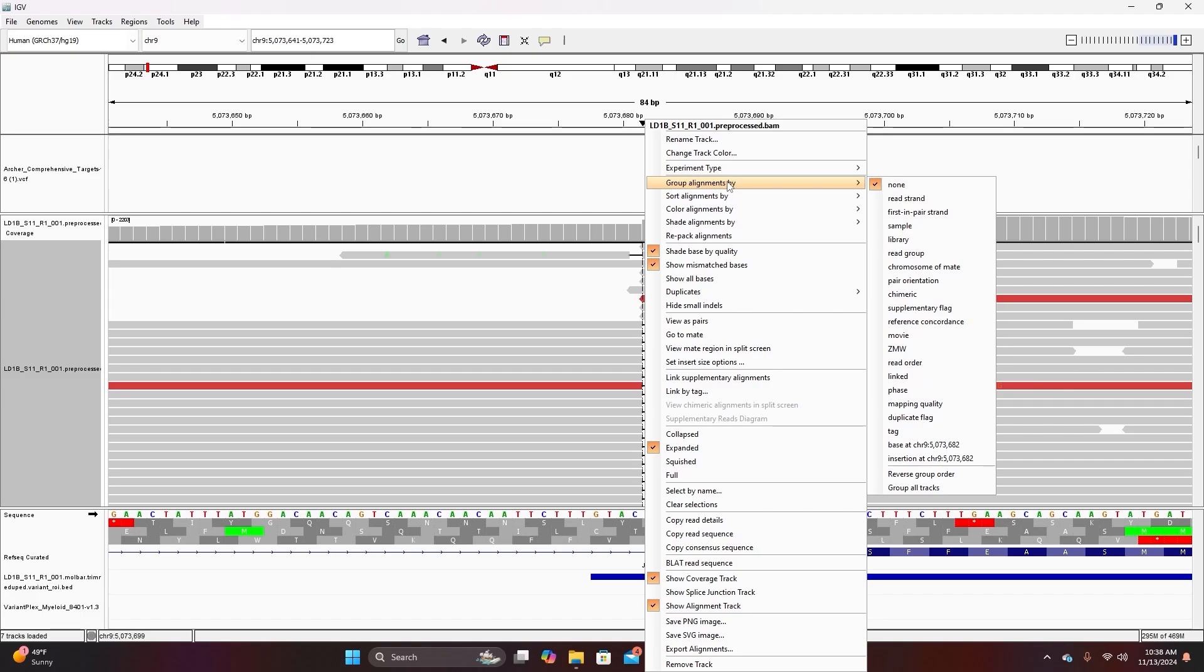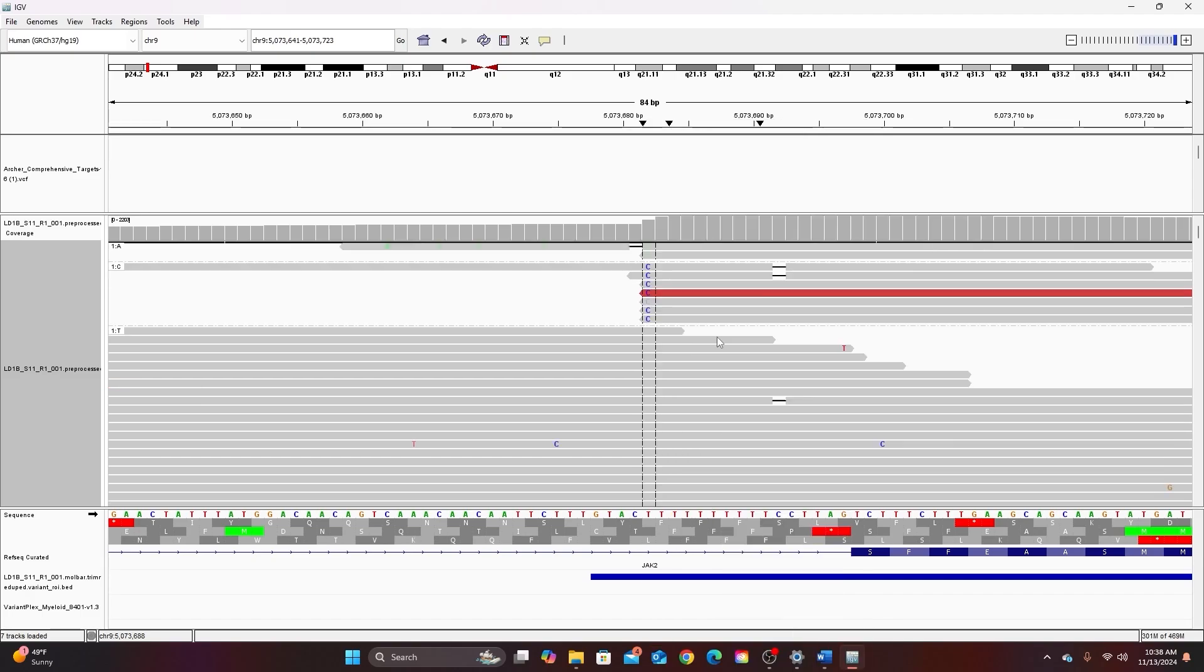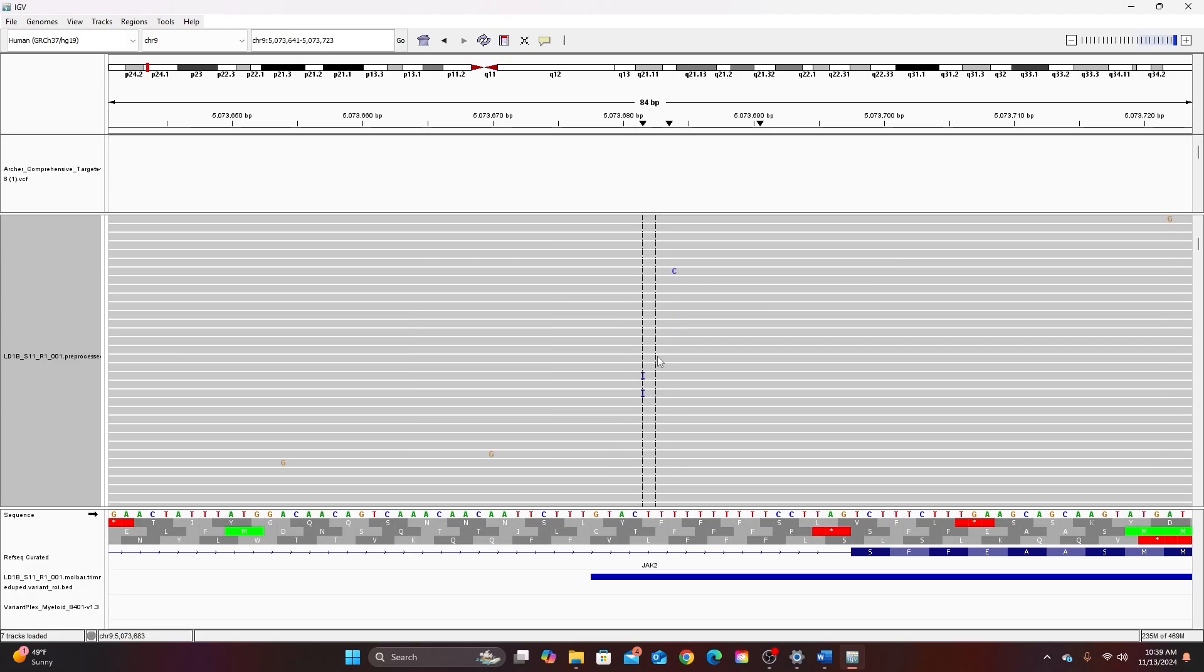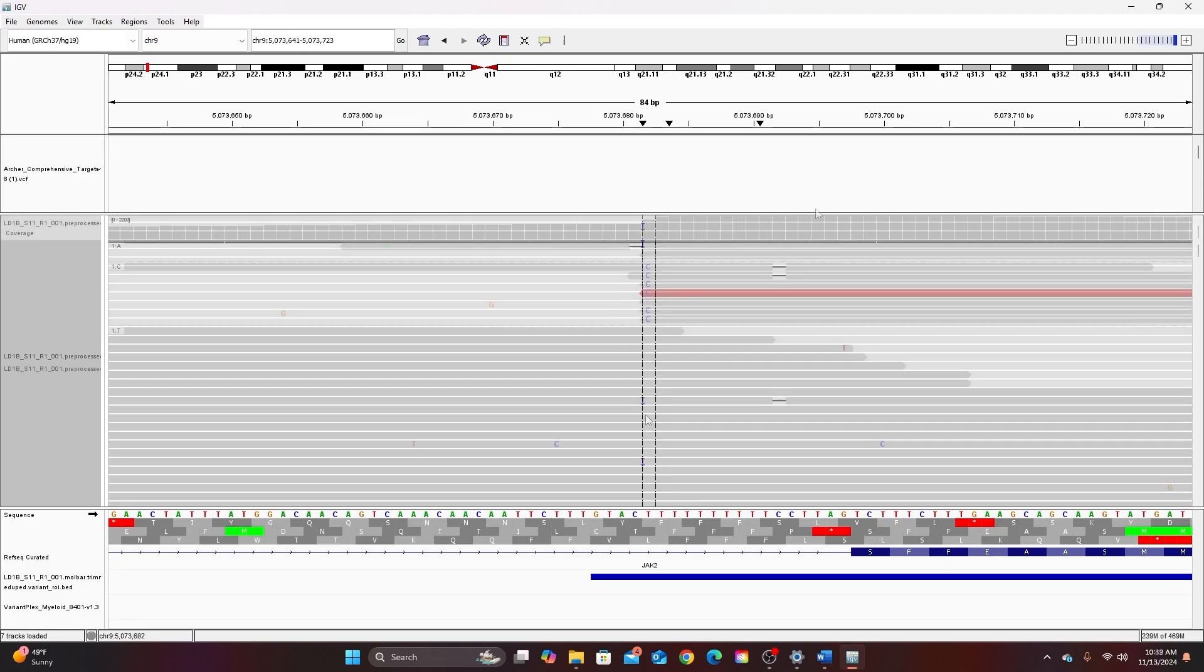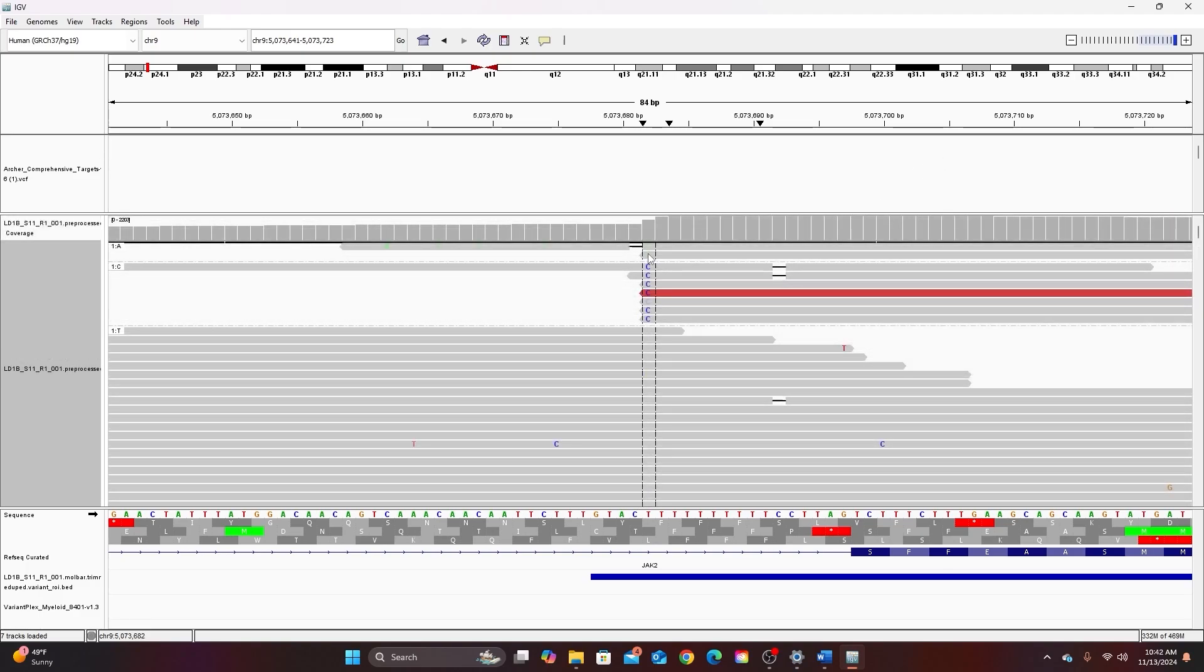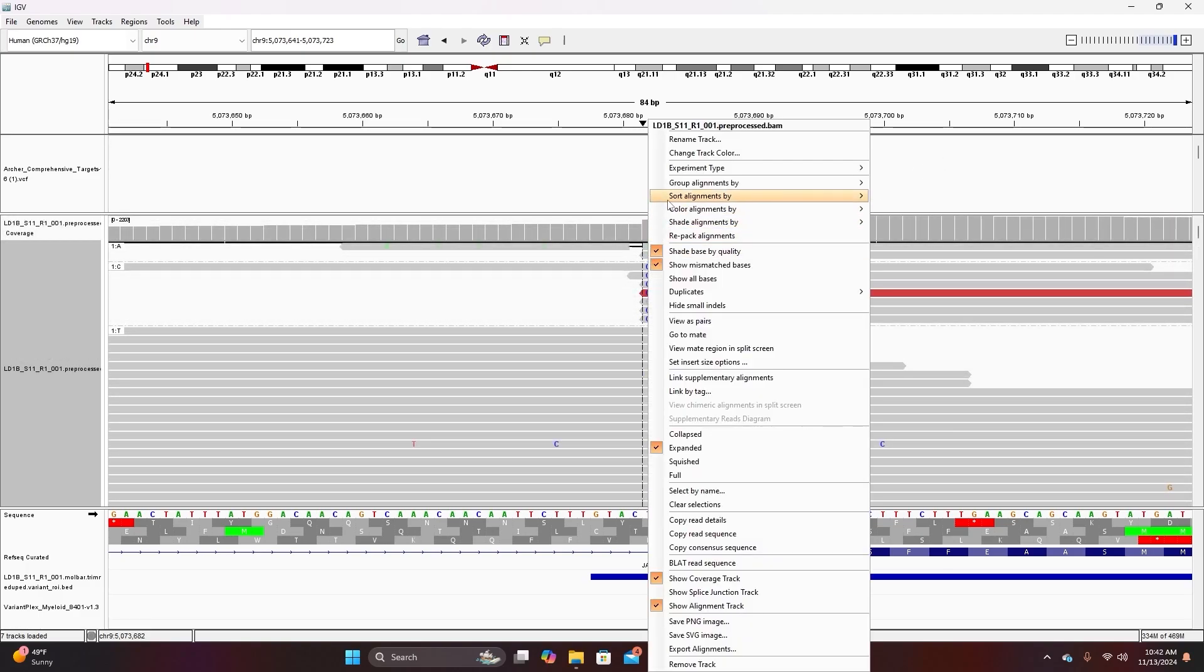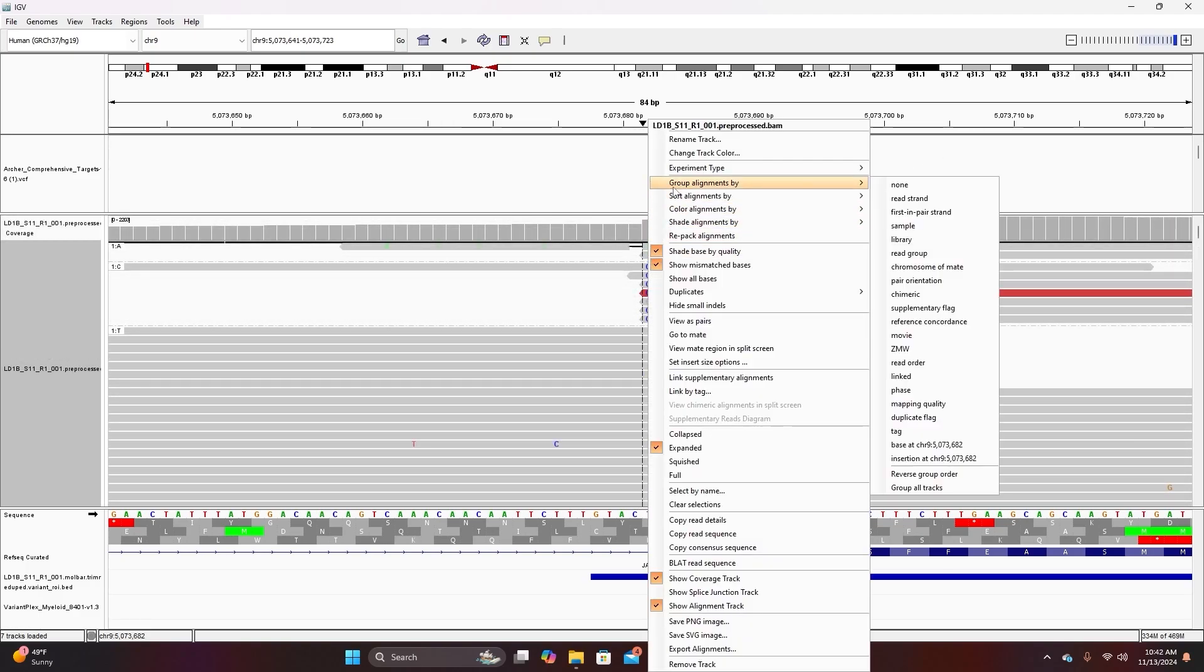This is similar to sorting the alignments except you're creating different sections for the different calls. So for example I could group alignments by base at this position and now you can see that a dotted line divides the different sections here. But this has removed organization by insertion because the insertion isn't exactly at this spot. The insertion happens between this position and the position before it. I can undo the groupings simply by going to group alignments by none.